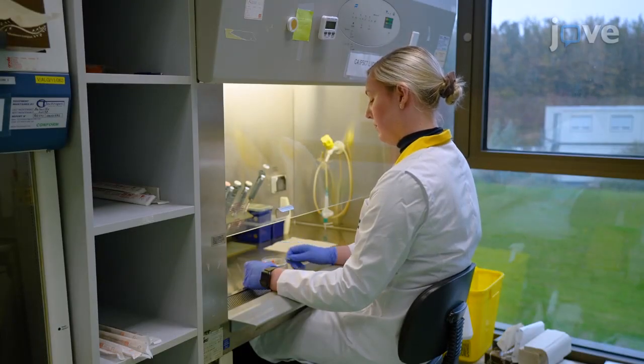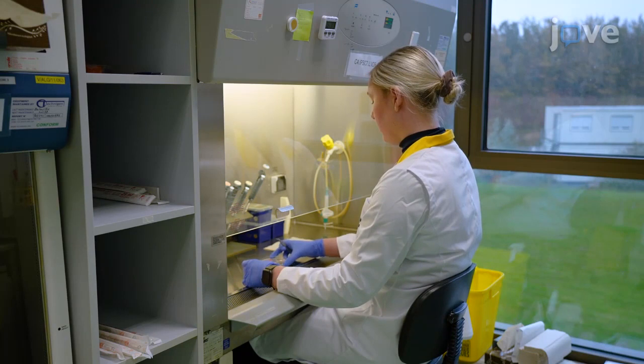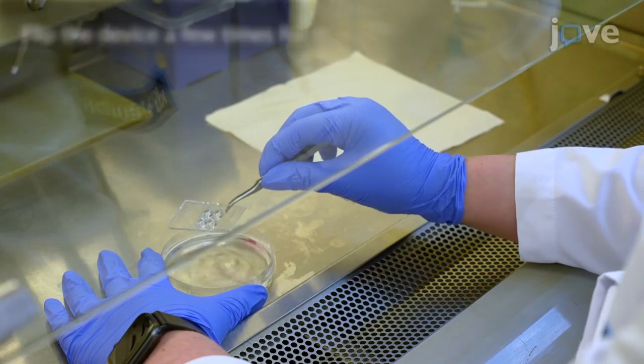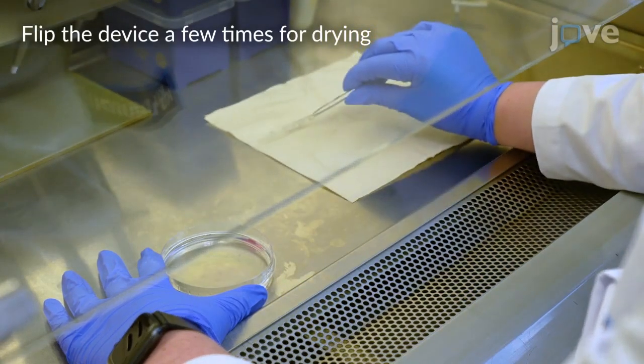Begin by transferring the device using the forceps from the shipping container to the petri dish containing 10 milliliters of 70% to 100% ethanol for sterilization for 10 seconds. Transfer the device with forceps to a piece of paper to air dry in the laminar flow for about 30 minutes.